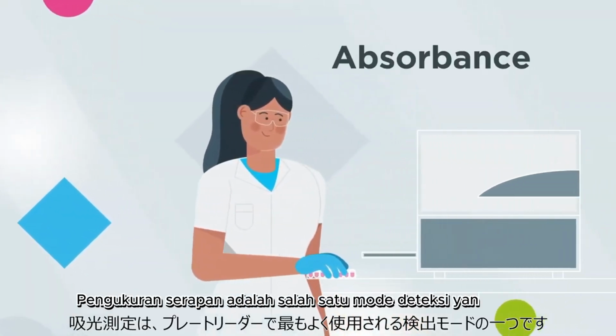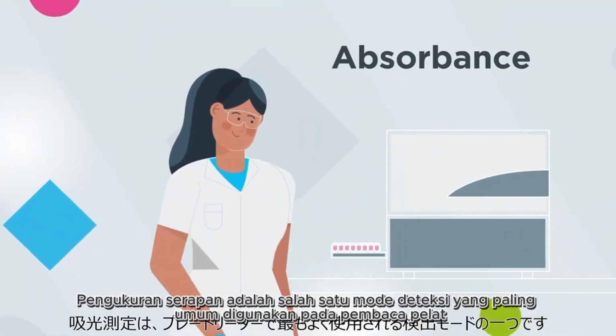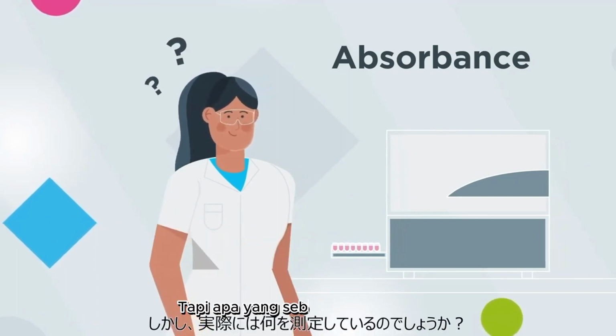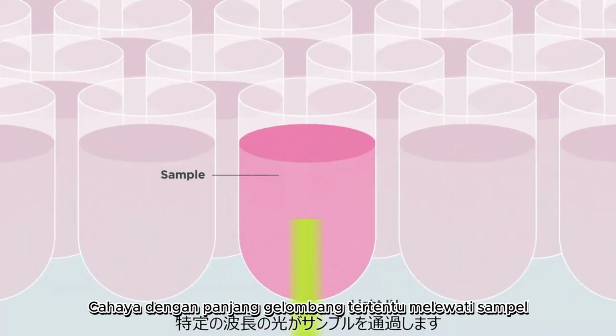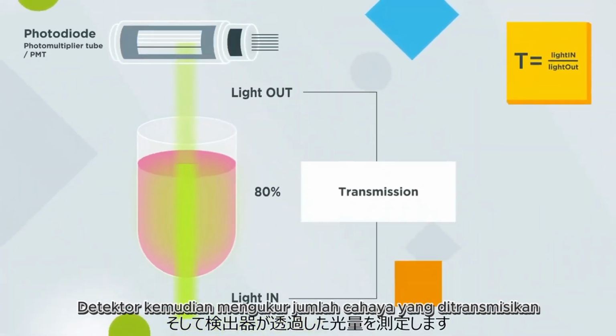Absorbance is one of the most commonly used detection modes in a plate reader. But what exactly are you measuring? Light of a specific wavelength is sent through the sample, and the detector measures the amount of light that has been transmitted.